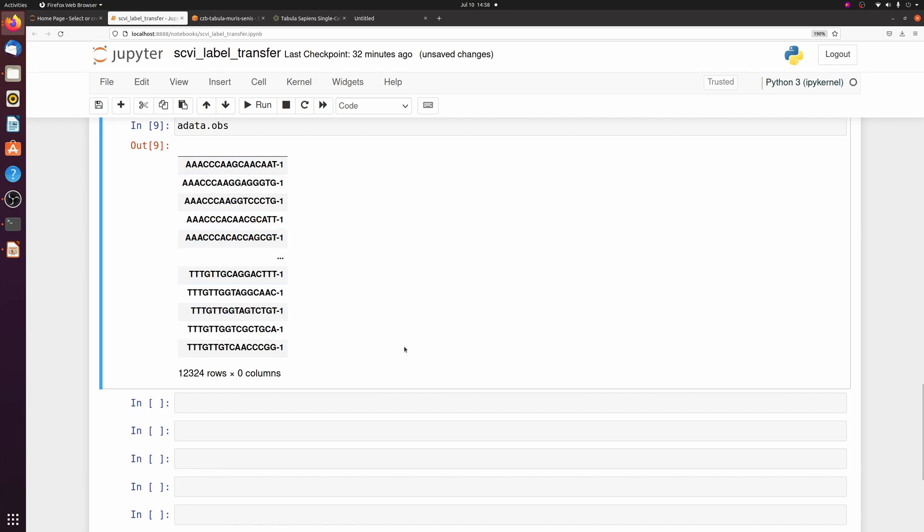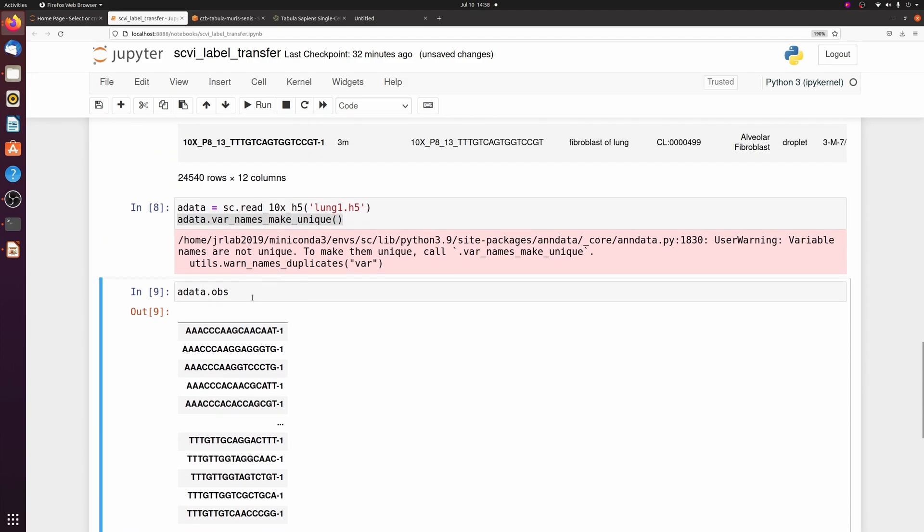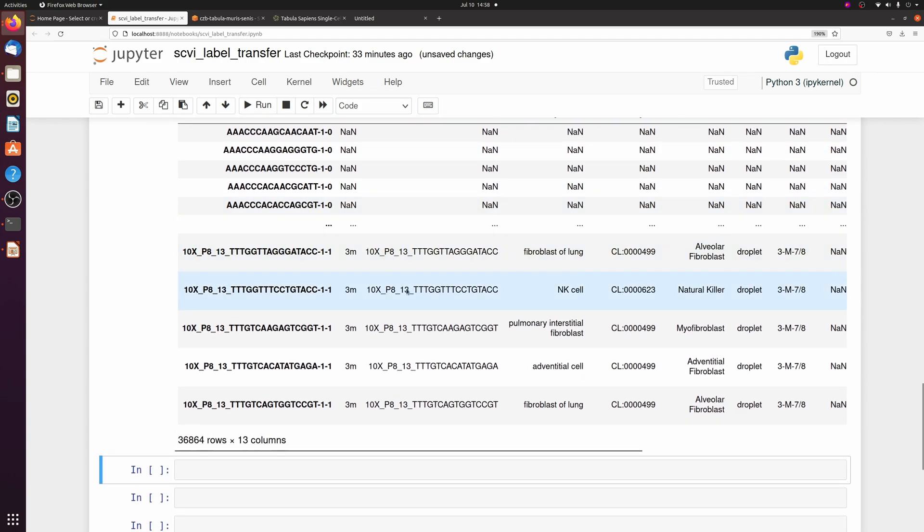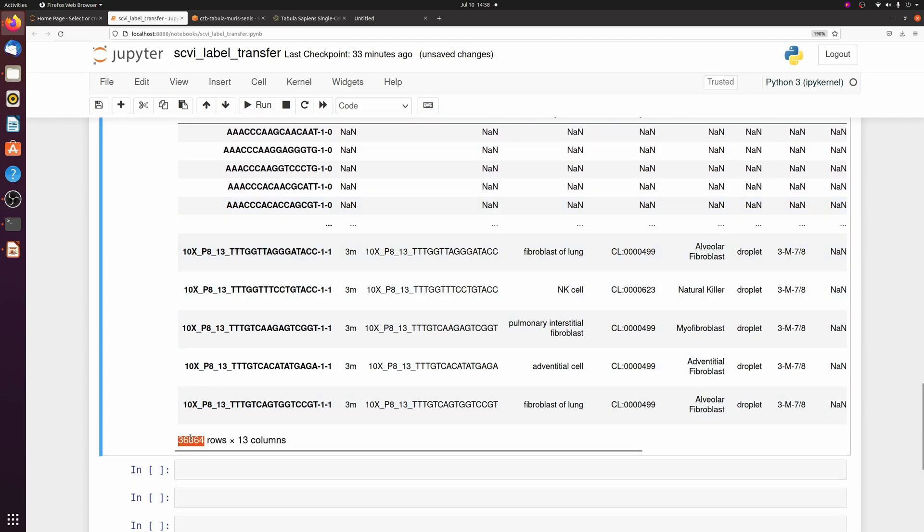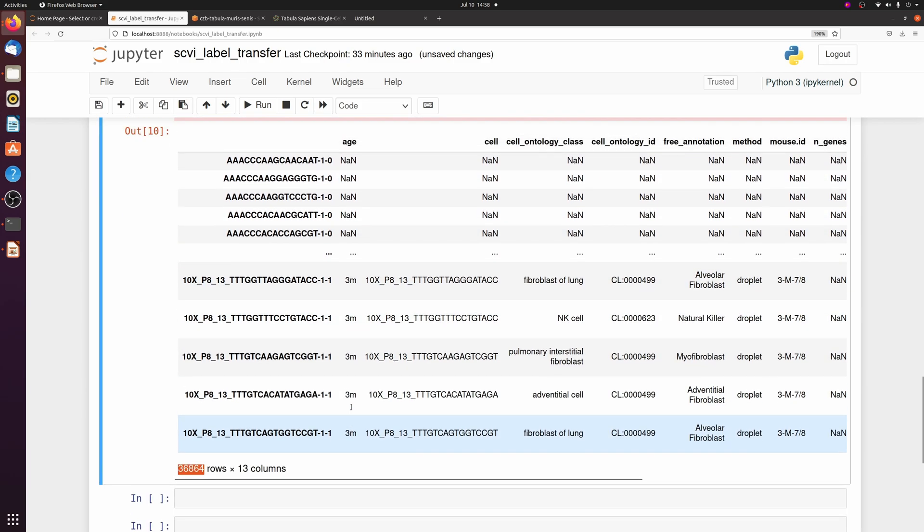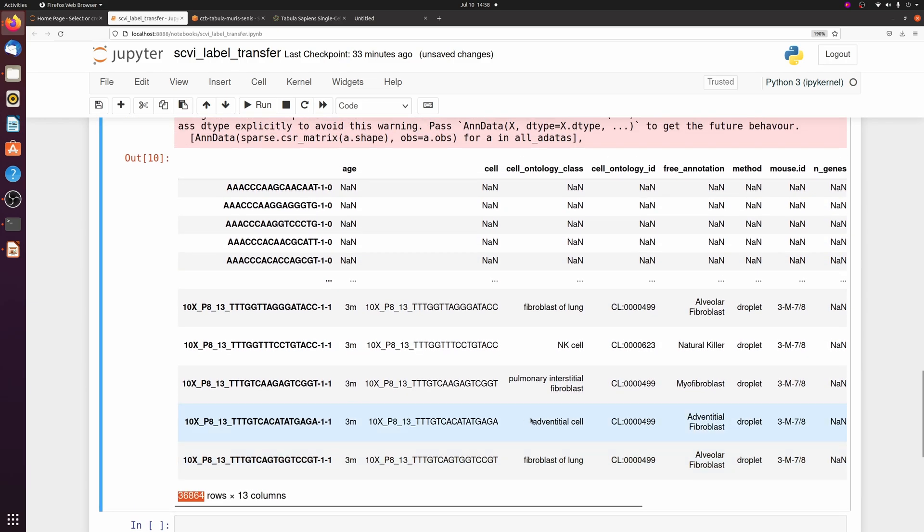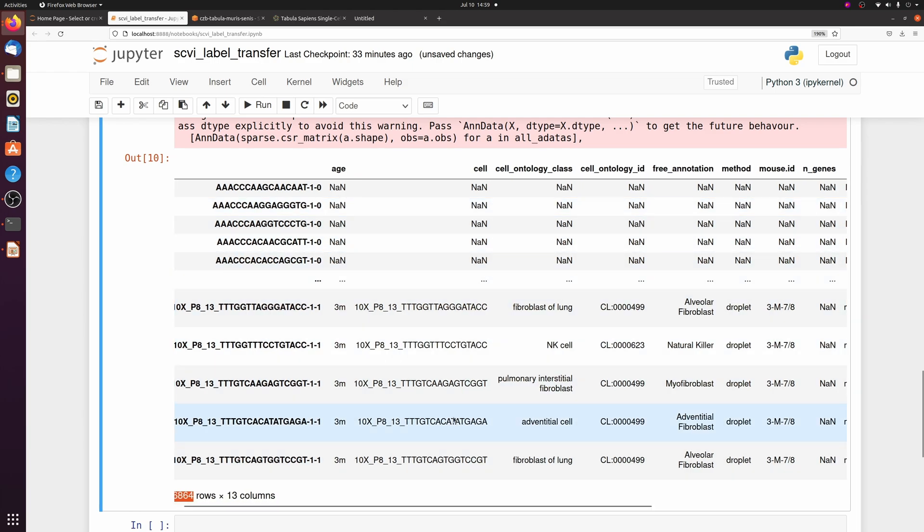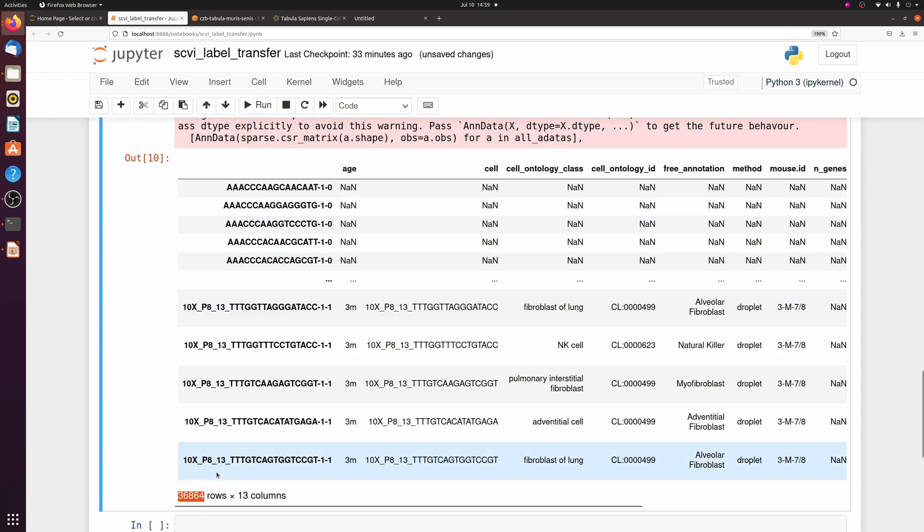So the first thing we want to do is actually combine the two datasets together. We're just going to do an adata.concatenate and we're going to pass ref data. You see it puts the datasets together, so we have 36,000 cells. It just puts NA for all the columns that weren't in our dataset.